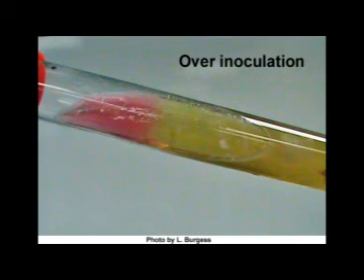In correct technique, a needle is used to avoid over-inoculation of the TSI slant. Using too much bacteria can cause all three sugars to be quickly used up in the very top of the slant. This can sometimes be confused for reversion or alkaline acid conditions when in fact all three sugars have been used. Avoid over-inoculation by not using a loop, and when running the needle up the slant, remove it from the slant right before you reach the very top. This will prevent misinterpretation of your test results.